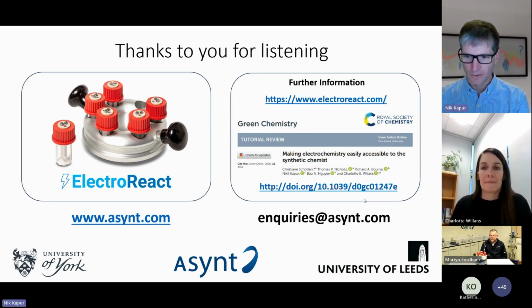One question's coming. Can this technology be implemented into flow processes? Yeah, absolutely. I think when I started working with Charlotte initially, we continue to work on flow electrochemistry. So here there are 2 electrodes that are held a fixed distance apart, and a flow path between those. And we have published in that area. So actually, electrochemistry is certainly amenable to flow processes as well.